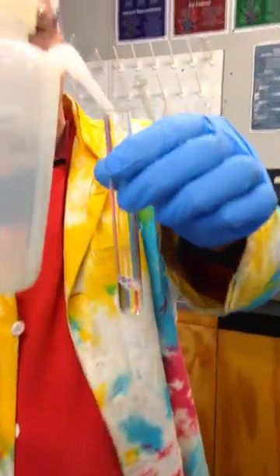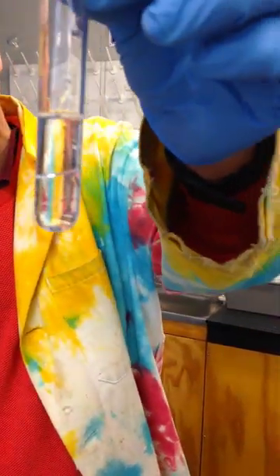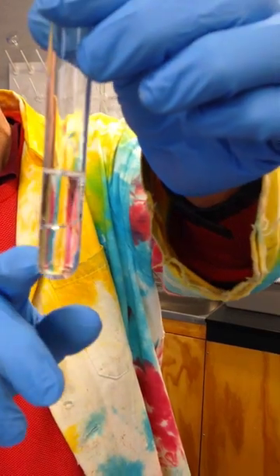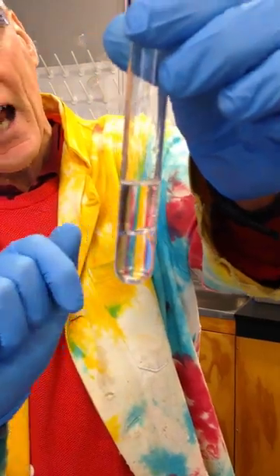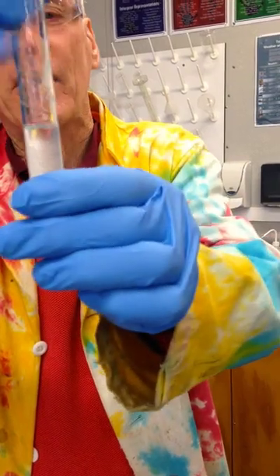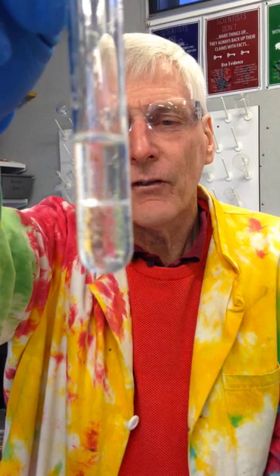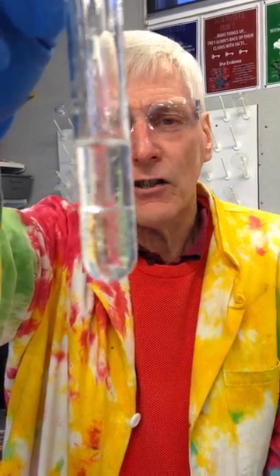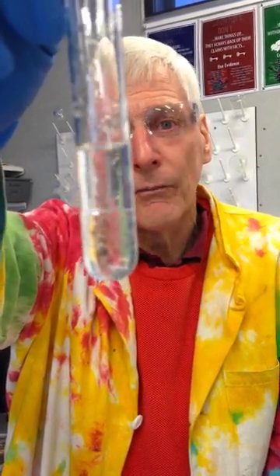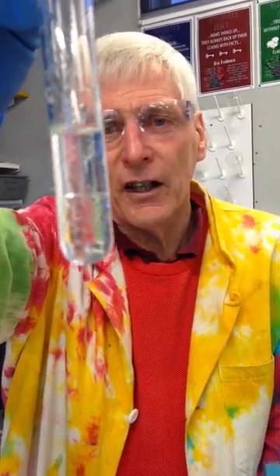Now, hexane and water. This time, you can see that the water goes straight to the bottom. So we've got a layer of water here, a layer of hexane here. Hexane's less dense than water. And if I shake it, mix it up, it goes that cloudy color. But as you can see, once you let it settle, the layers come back. Hexane is not soluble in water. This is immiscible, and this is not a solution. We've got two separate layers going on there.